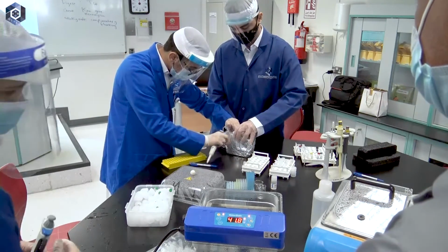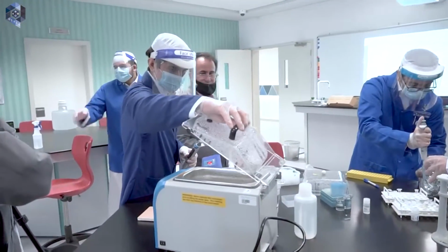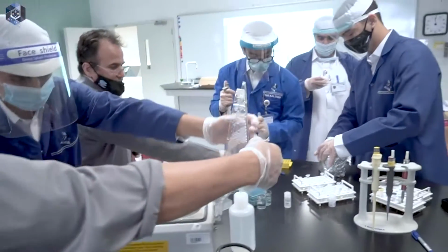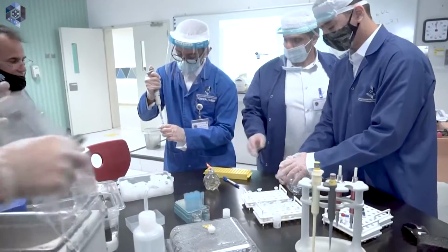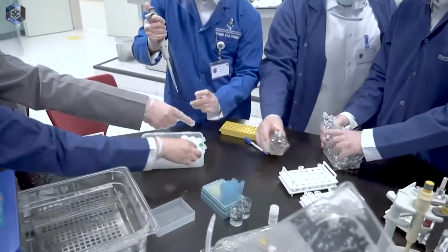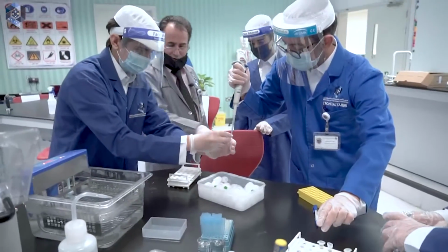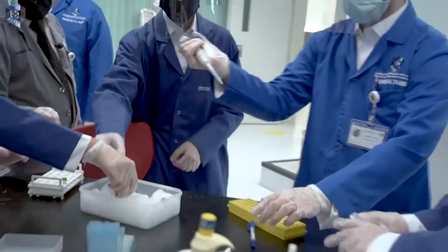Prepare the other water bath with the 37. Remove the cap. Add. Open. Help him open this. No need for the flame. No need for the flame. Close and put here. The other one, open the other one.